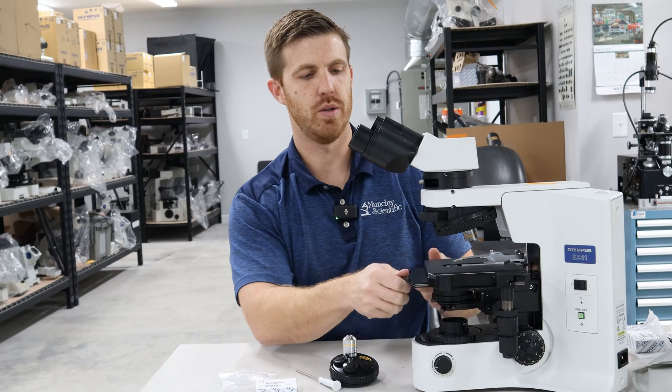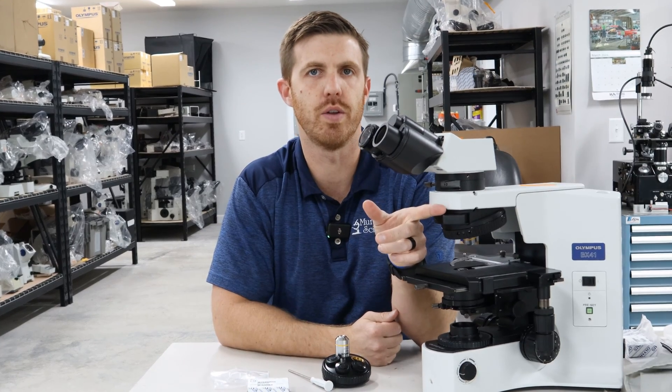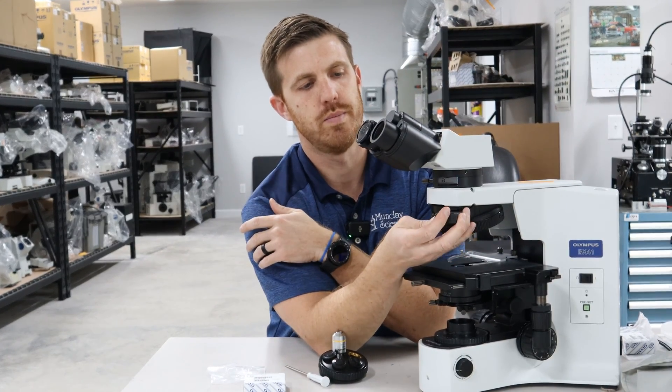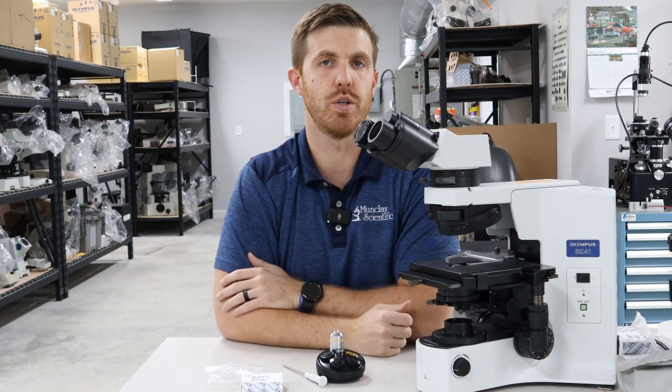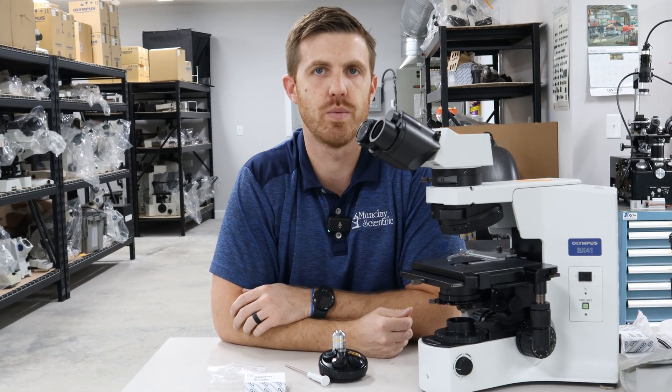It's very simple and you can see the crystals that you want to see. You can also use, instead of this analyzer, if you're looking at gout crystals — a lot of people use a U-GAN. That's a very popular accessory as well.